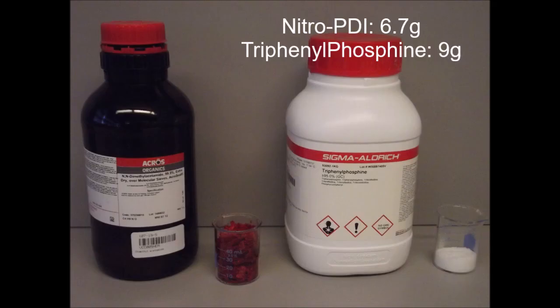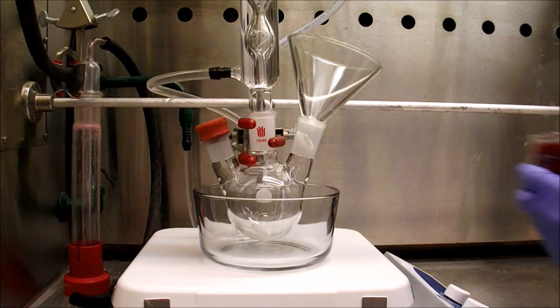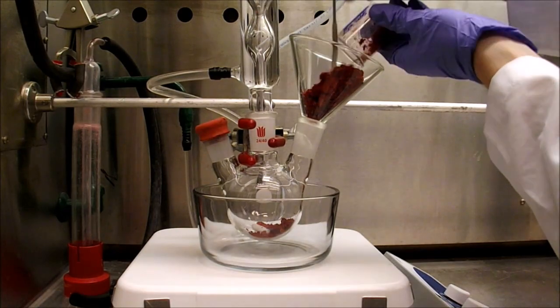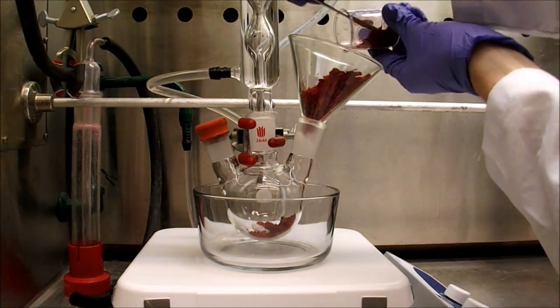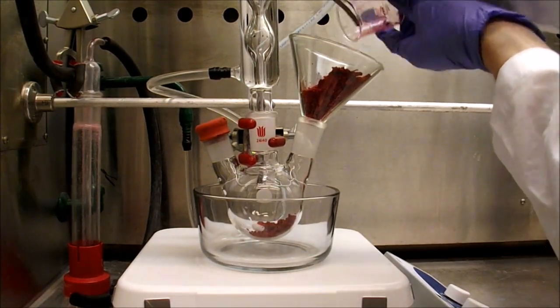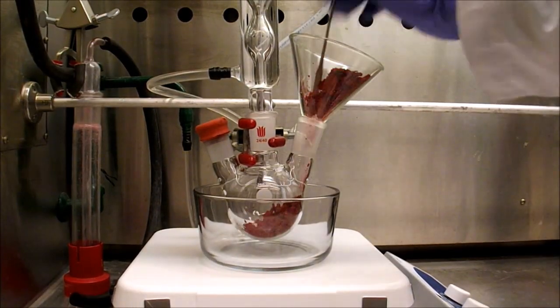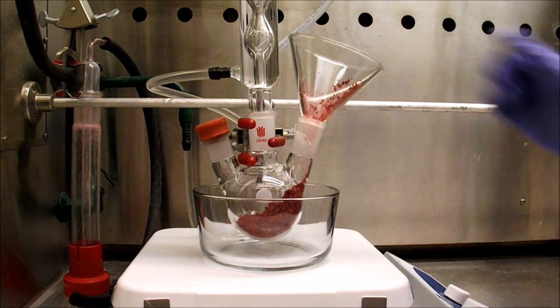For this reaction you will need nitro-PDI which we made in a previous video, triphenylphosphine, dimethylacetamide, as well as hexanes and dichloromethane for washings. To a three neck round bottom flask with a stir bar is added perylene diimide and triphenylphosphine. This reaction is done in an inert atmosphere of nitrogen and purging is more thoroughly done with a three neck flask instead of a normal round bottom flask.